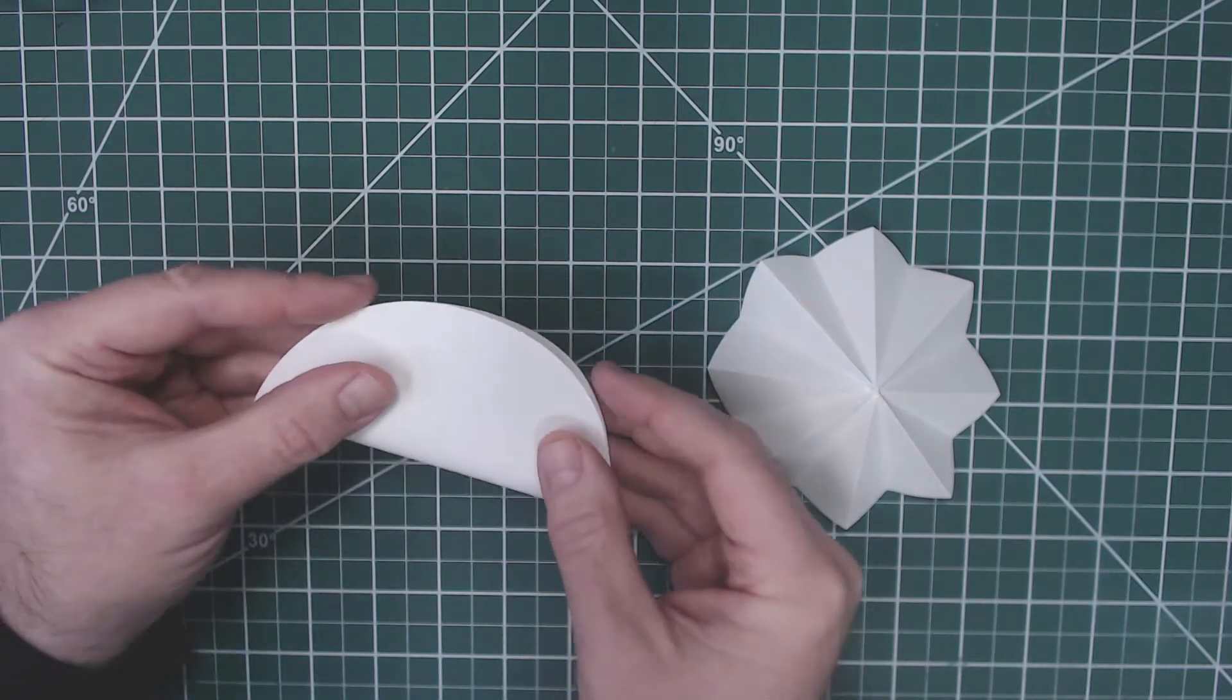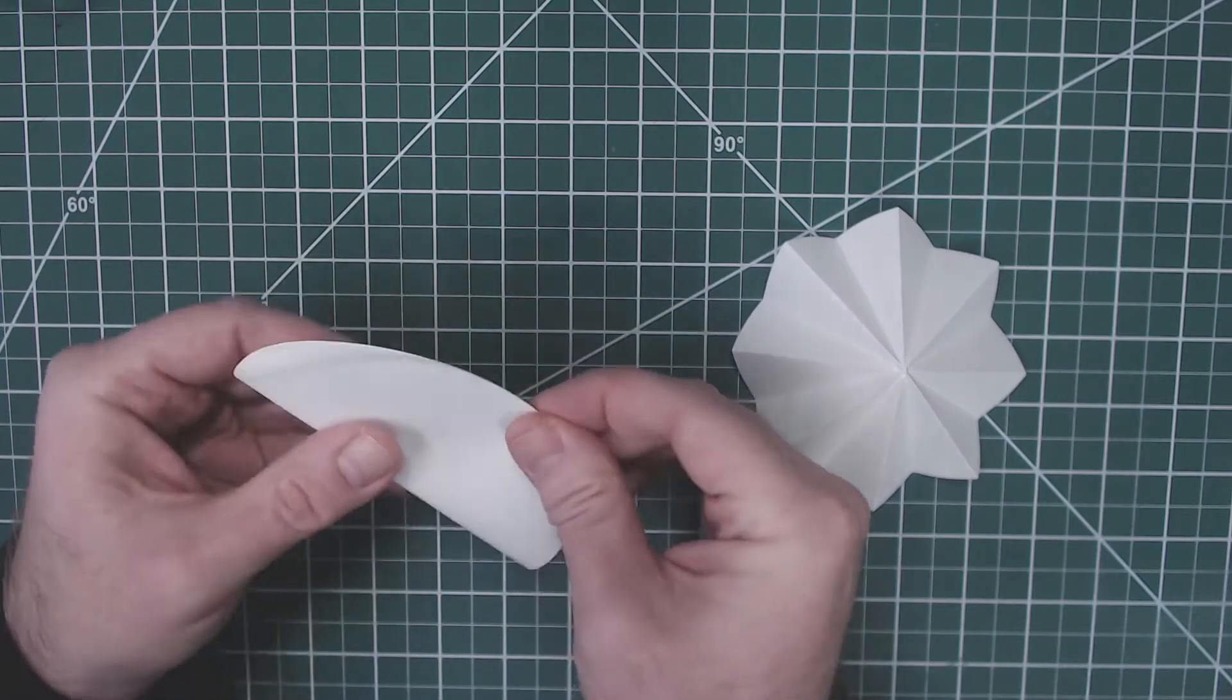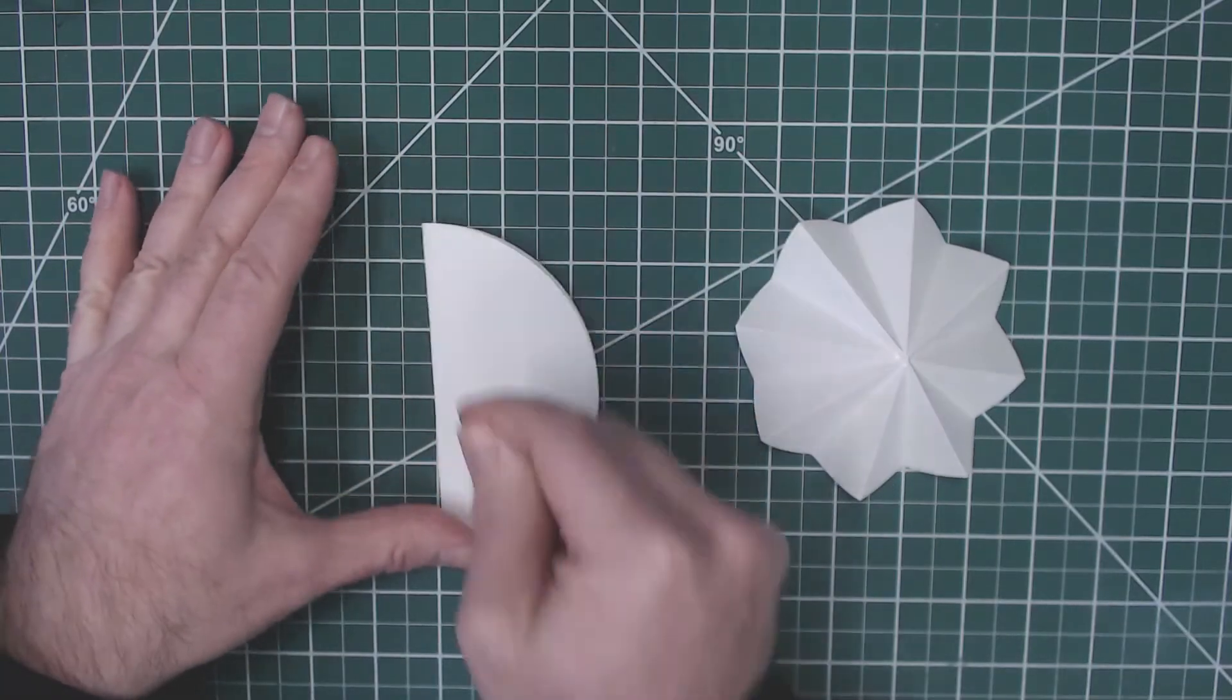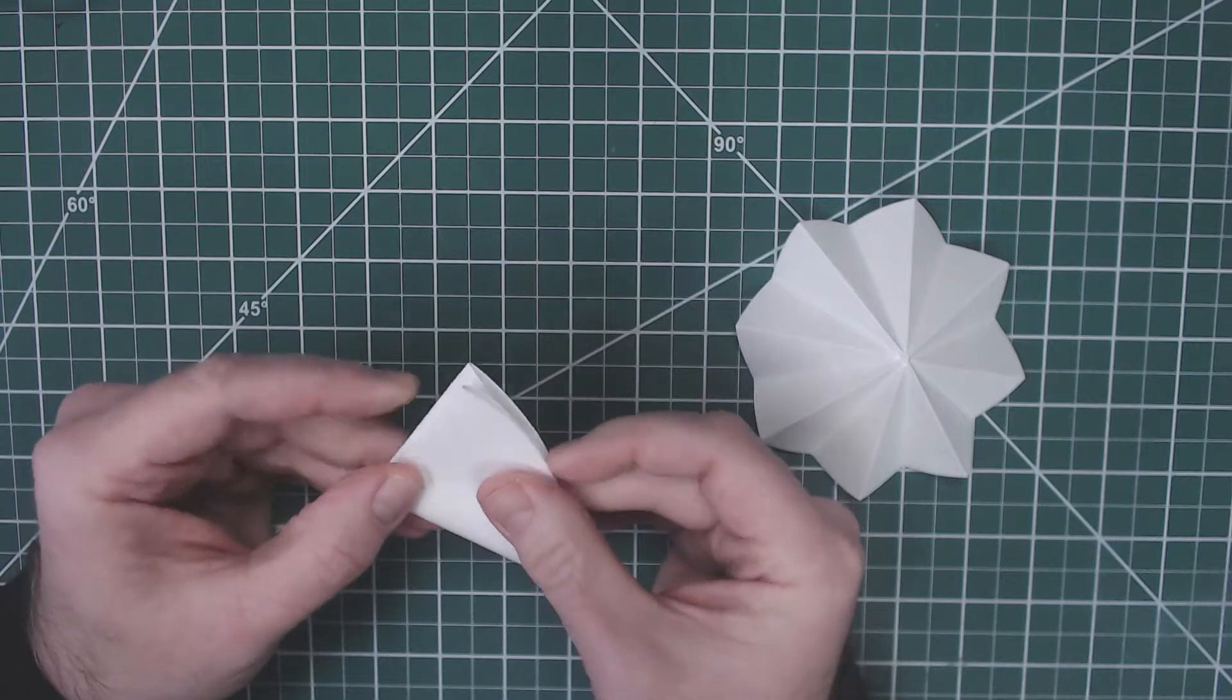First step is to take your piece of filter paper and fold it in half and just put a little crease down it. Then we're going to take that piece of filter paper and fold it in half again.